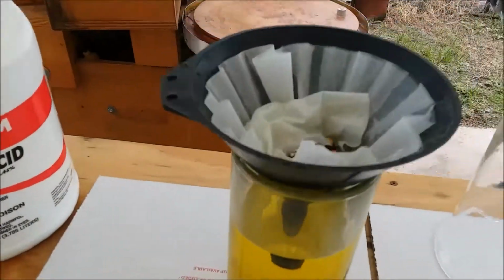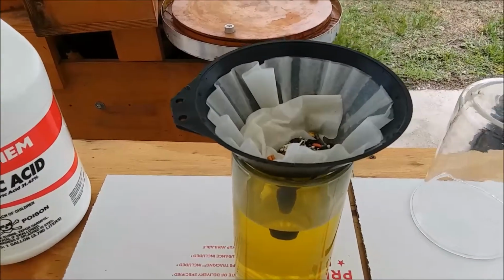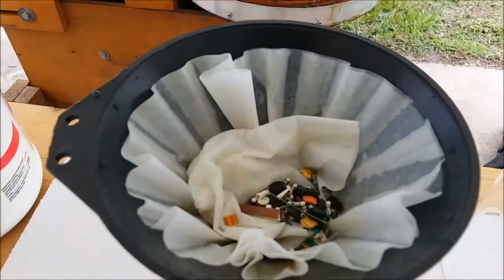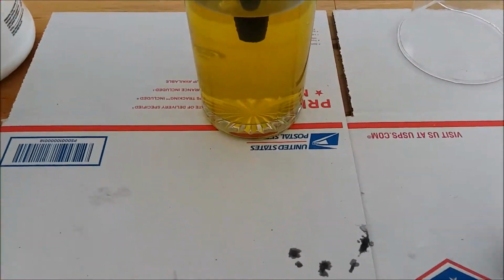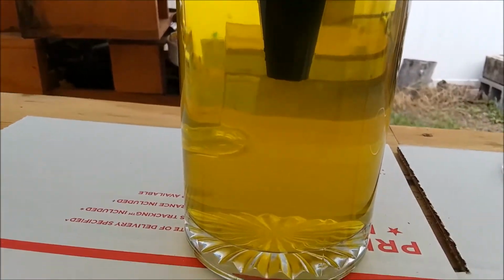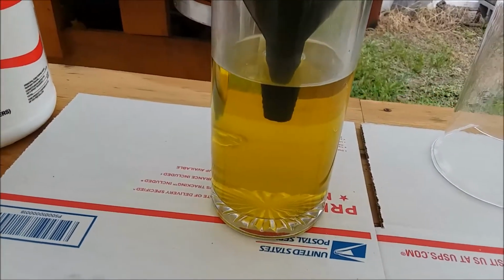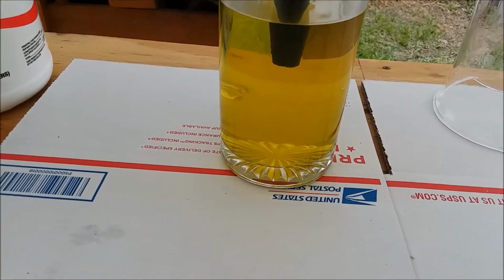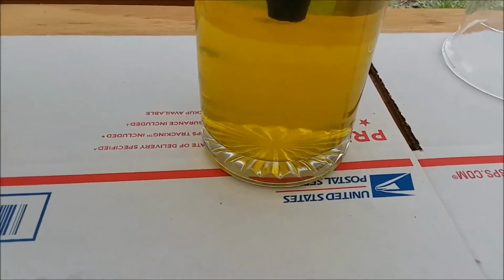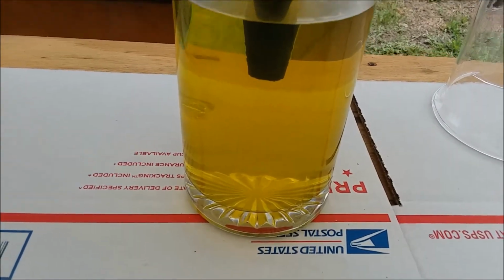Okay, it's all filtered. I got probably about as much of the yellow color out of these filters as I'm going to get. I'll just add them to my gold filter jar with the debris that's in it and process all the gold filters another time. I'm not really happy with the way it looks. It's kind of cloudy. So something got through the filtering. Some fine chemical, insoluble in water. Maybe some silver chloride, maybe some lead sulfate, something.